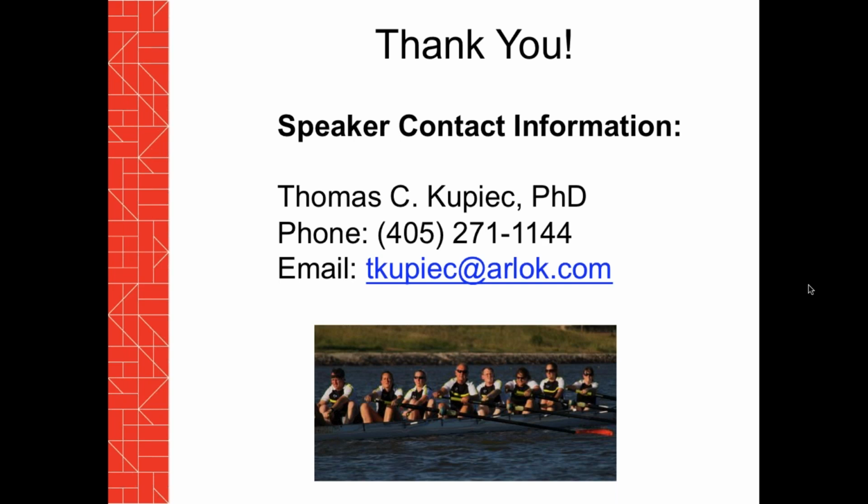Another question is, what should happen if a product fails method suitability, meaning that one or all of the specified organisms would not grow? This is James again. USP 71 gives some really good guidance on that.